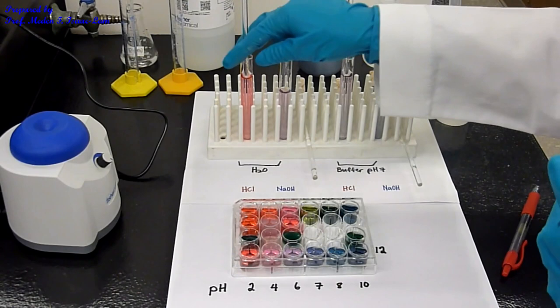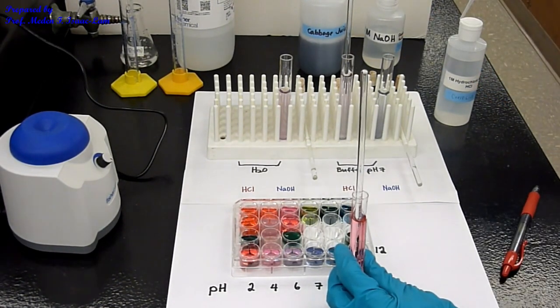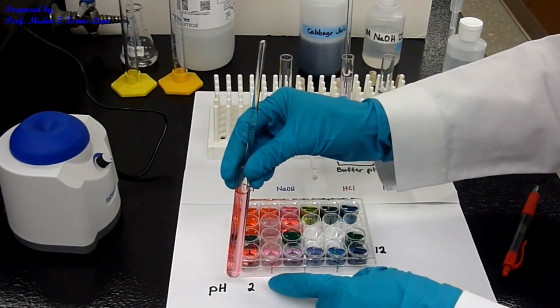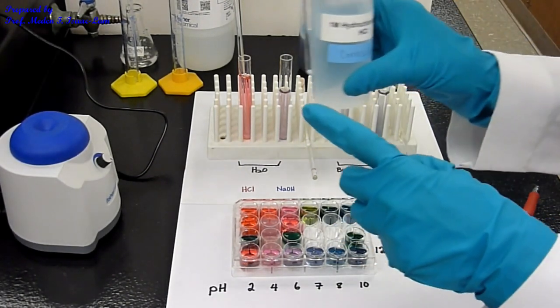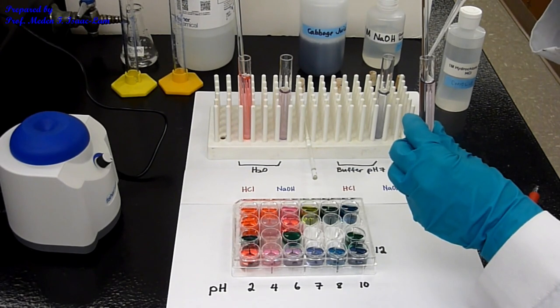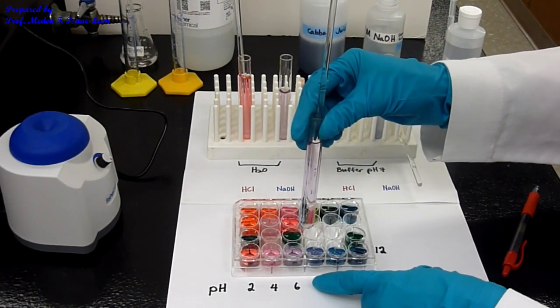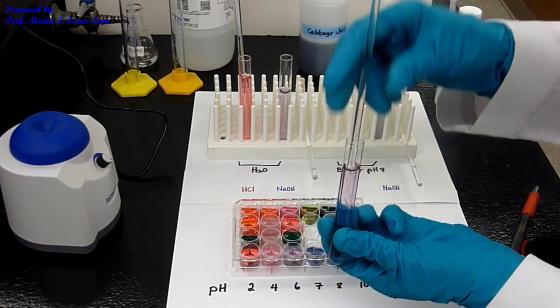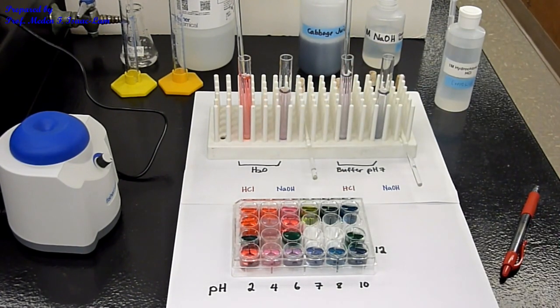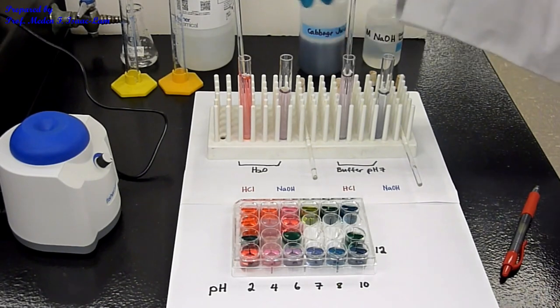So now the last drop is 3 drops. We go back here. So it's now intensely pink. Again, I'm adding 1 molar hydrochloric acid. And now we're going to do the buffer. So again, just 1 drop. So it's still around 6. You see the difference between this water and the buffer. This one is really intensely pink. Okay, so we're done with the hydrochloric acid. Put it back. That's the result of the hydrochloric acid.